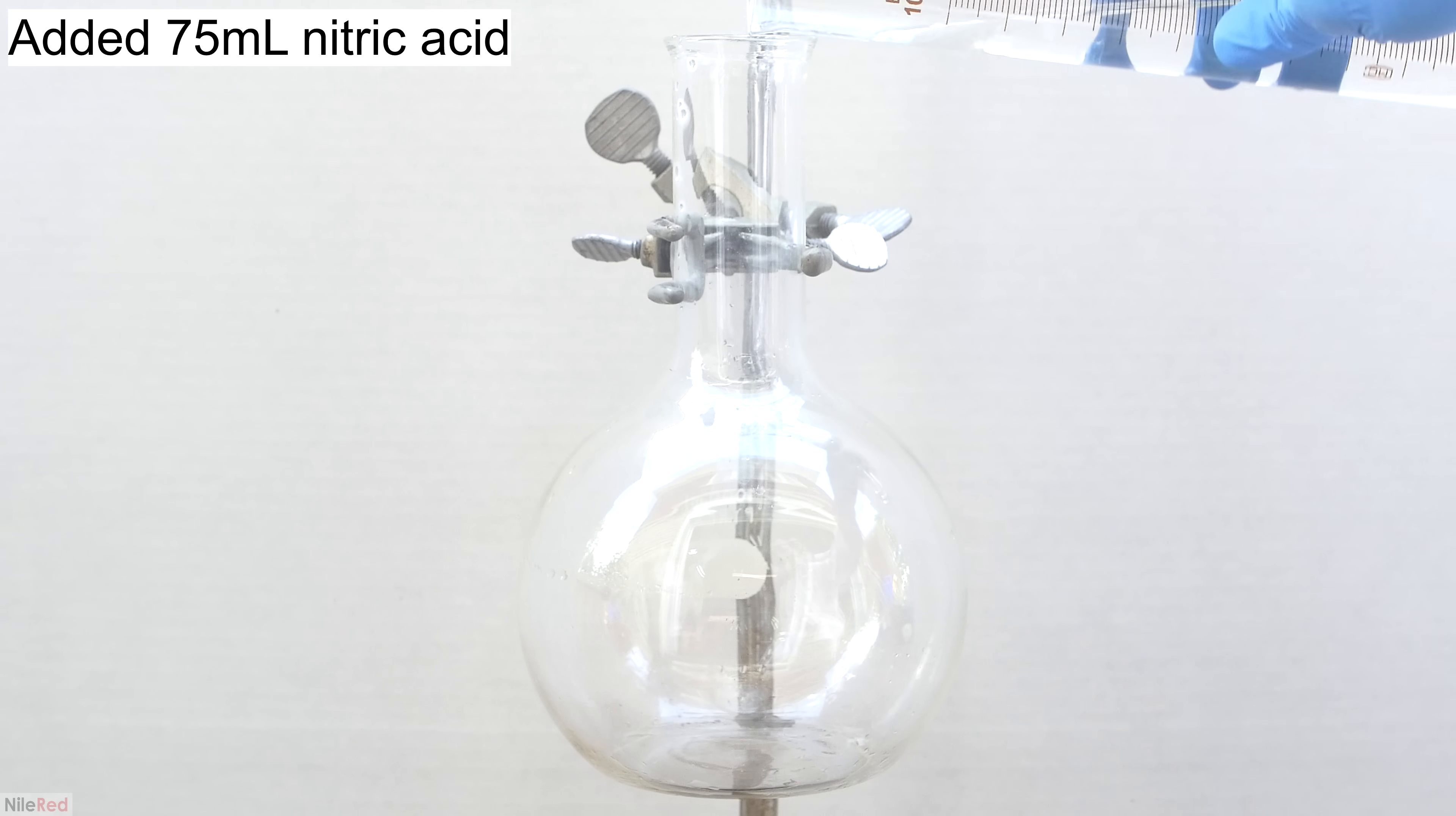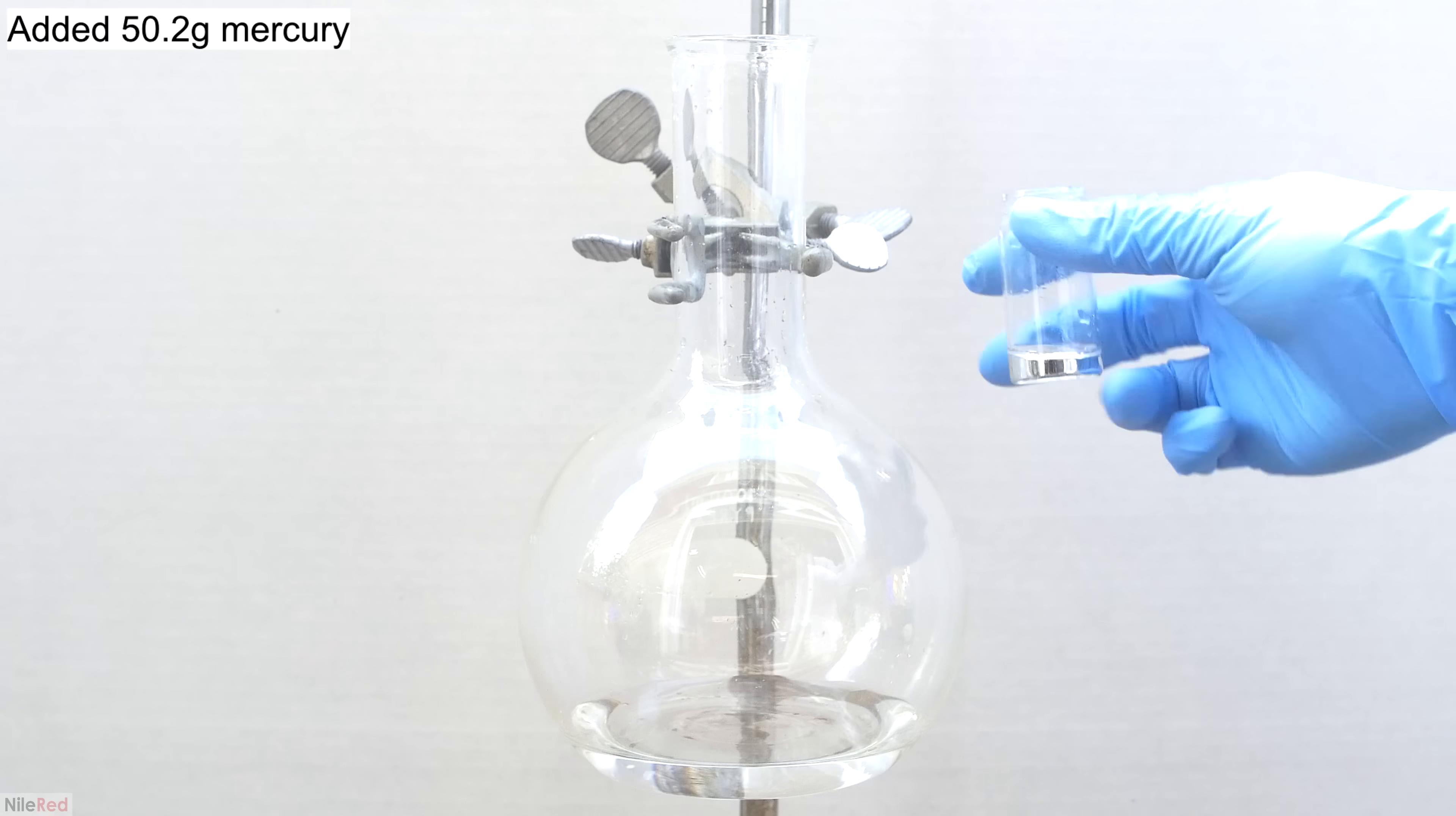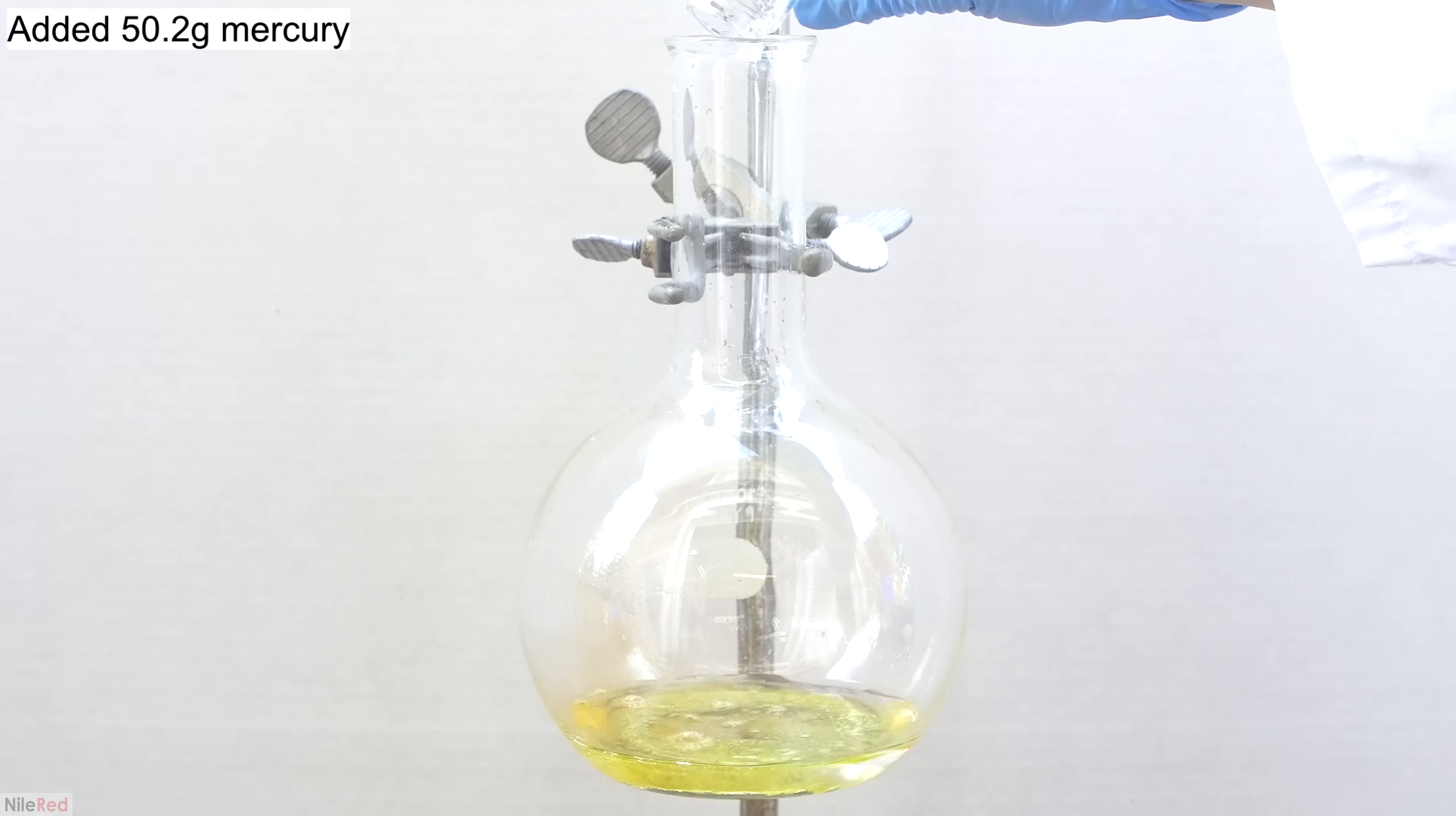To start things off, I added 75 milliliters of concentrated nitric acid to a 1 liter boiling flask. Directly into the nitric acid, I then poured in 50.2 grams of elemental mercury.